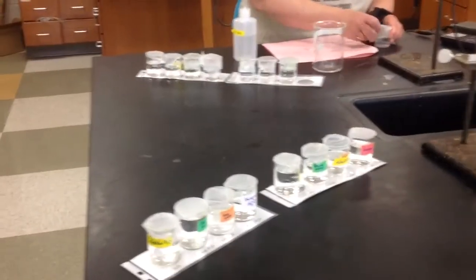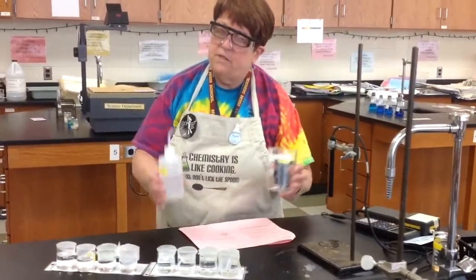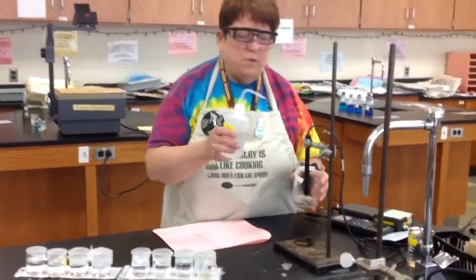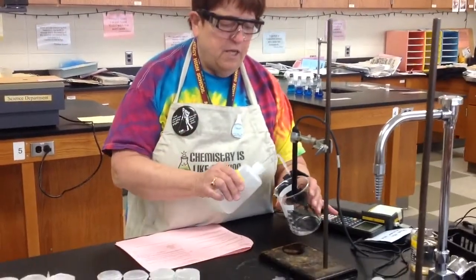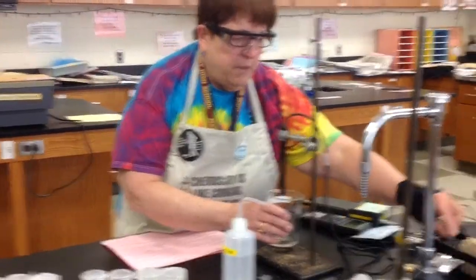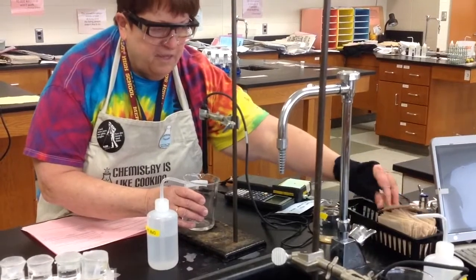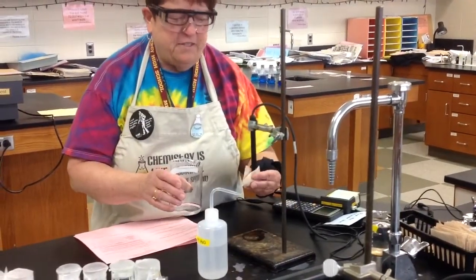In between tests, you really don't have to do this after the distilled water, but after all the others, in between you want to rinse the probe. There's a waste beaker, there's distilled water, just squirt some water around the edge here, and there's paper towel here. Take a piece of this toweling and dab off the end of the probe.